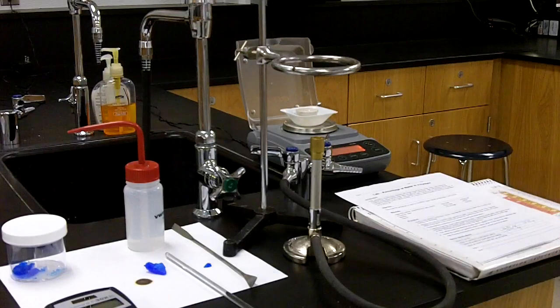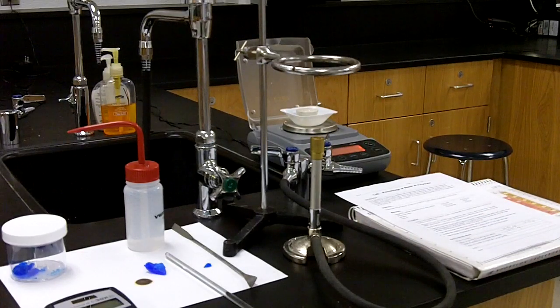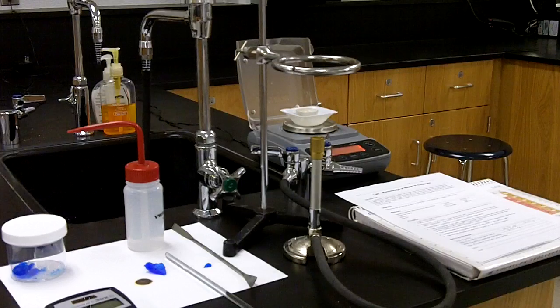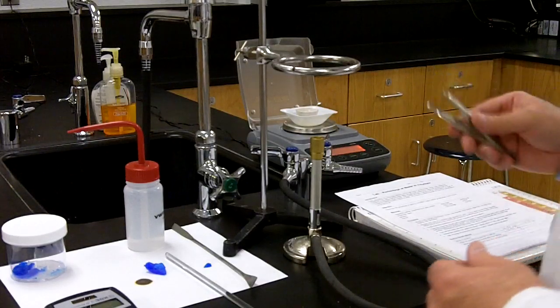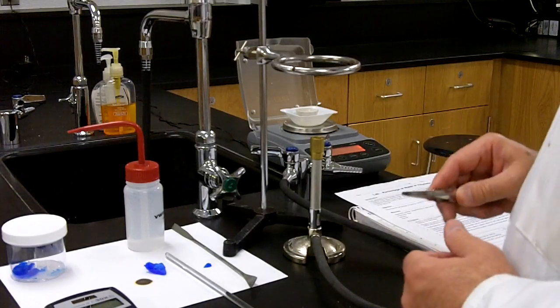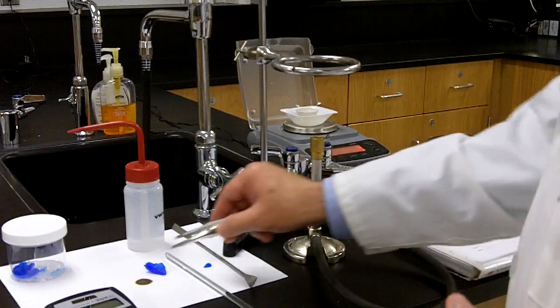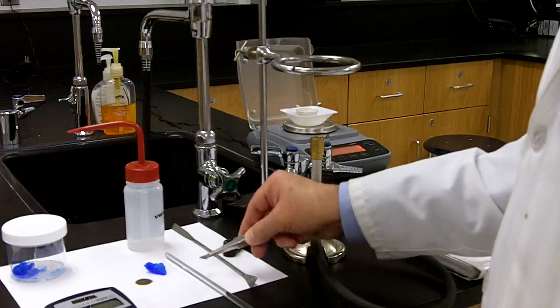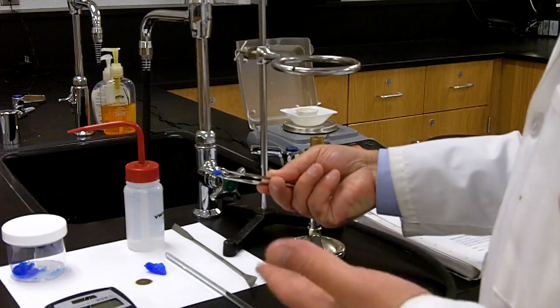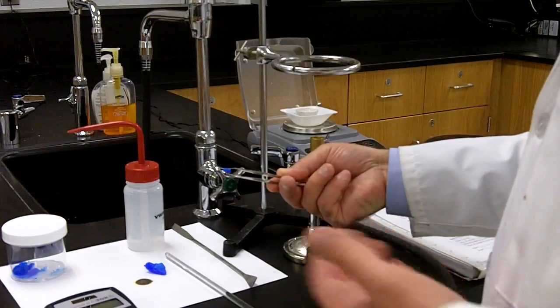The next thing I'm going to do is place a small amount of the copper 2 sulfate pentahydrate into the crucible. I'm not going to use that piece. I want to use a much smaller piece because it'll be a lot quicker, and I'll be able to get a measurement a lot faster.